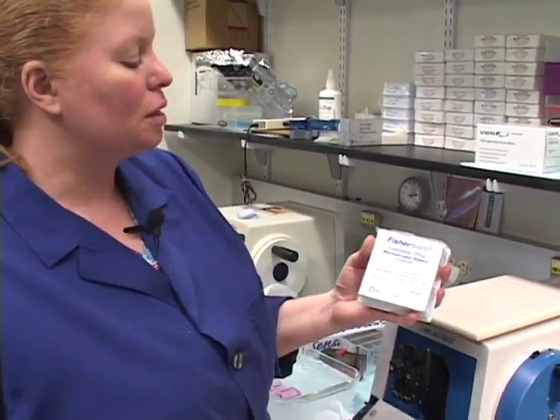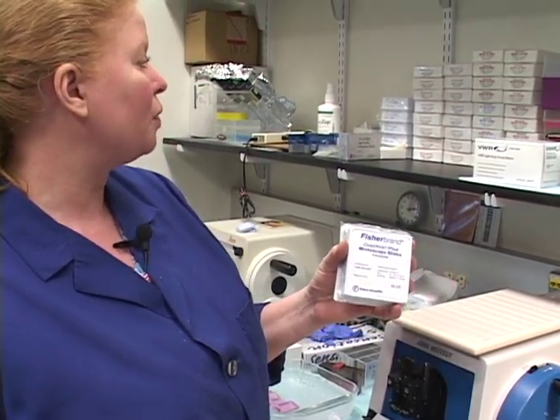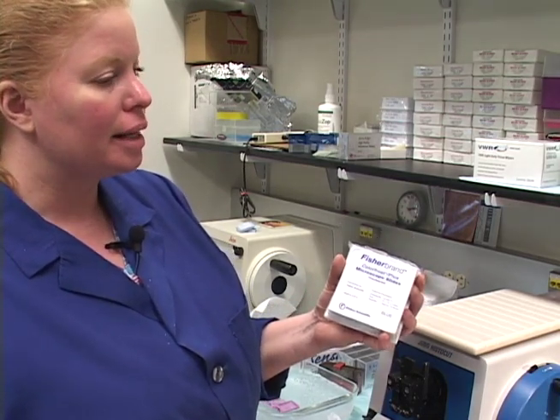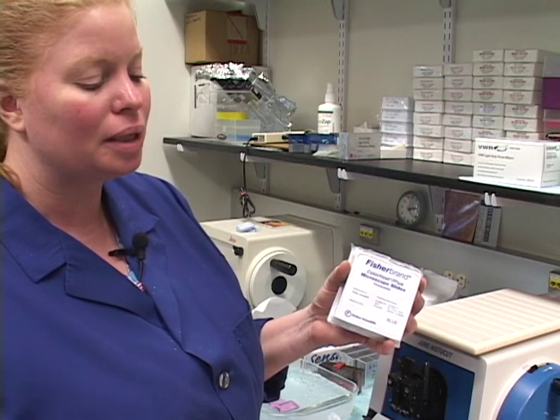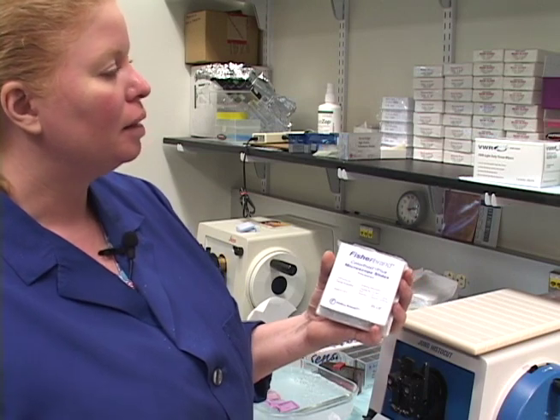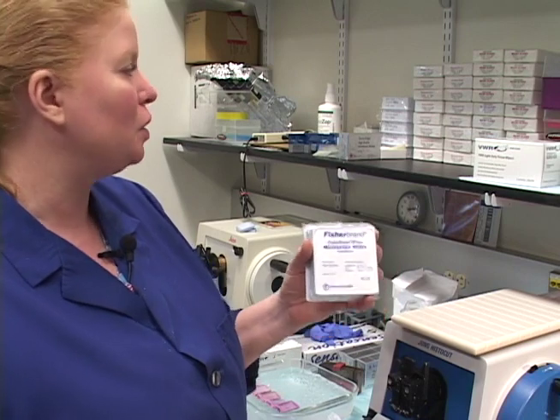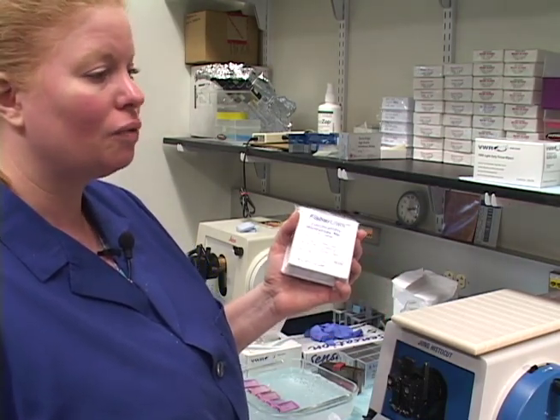The charged slides are great for just about anything but are quite expensive, so we tend to use the Snow Coat Extras as often as we can. Charged slides we'll use for special techniques — sometimes immunohistochemistry, in situ hybridization, and things where we want more reassurance the tissue won't come off. For frozen sectioning, the Snow Coat Extra slides have done quite nicely for us so far.